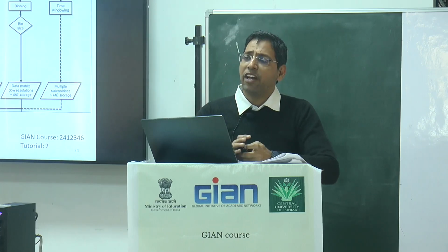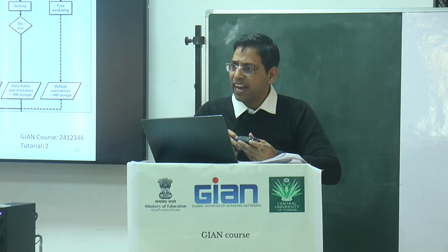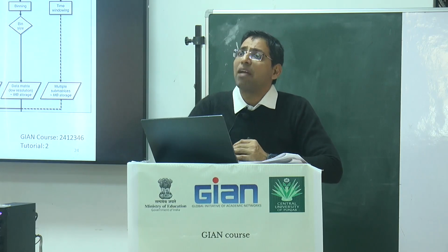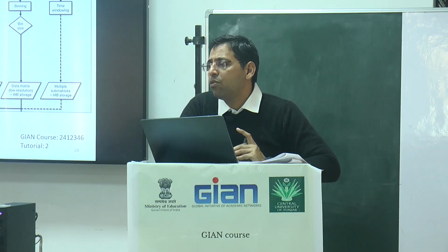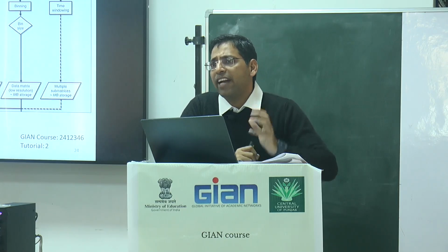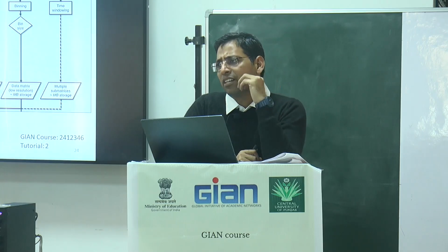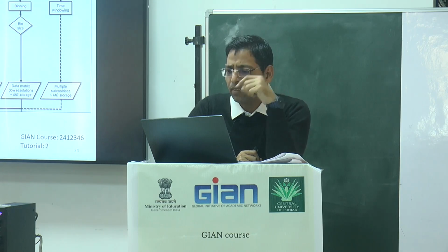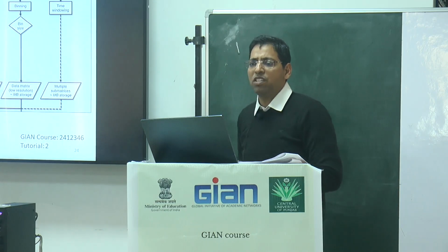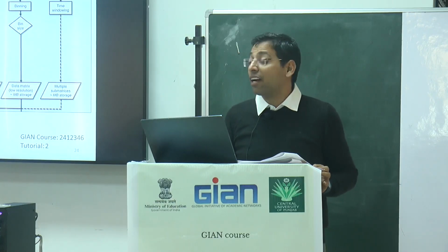Now when you are doing the compression of the data, what is the major issue that comes up with that? Sometimes you lose some dimensions. So you have to decide which dimension, which feature is the most important for you, so that if that is lost during the data compression, then you have to change the data compression concept actually. You use some other criteria for the data compression. So LC-MS datasets pose significant computational challenges for all of us because of their size and complexity.